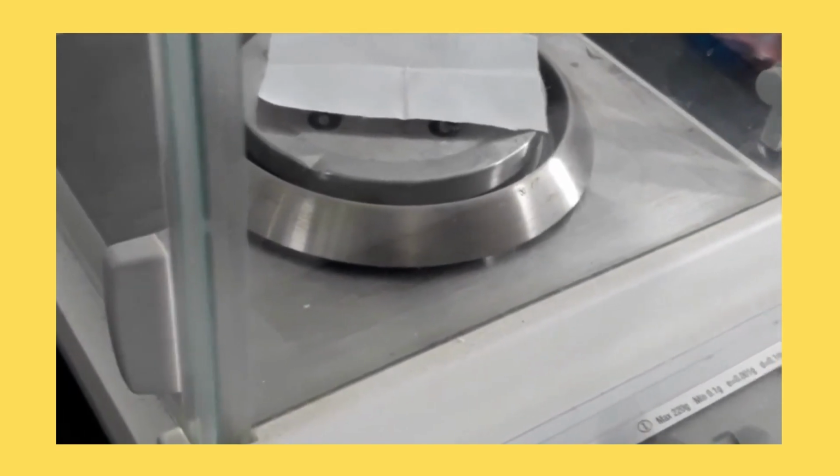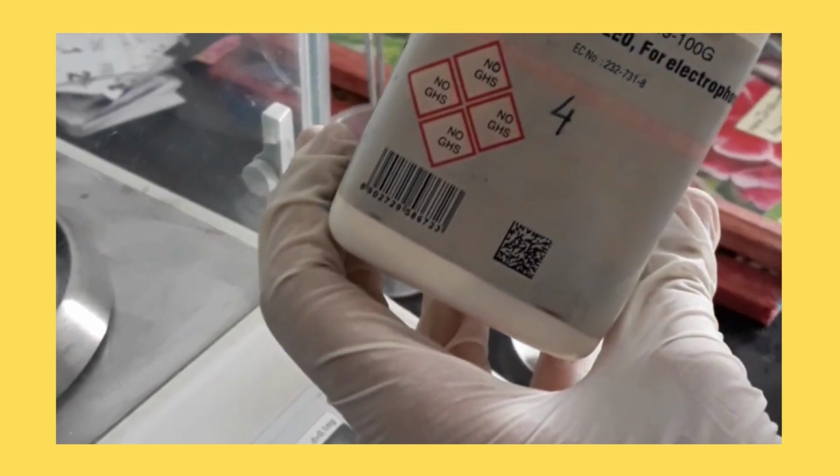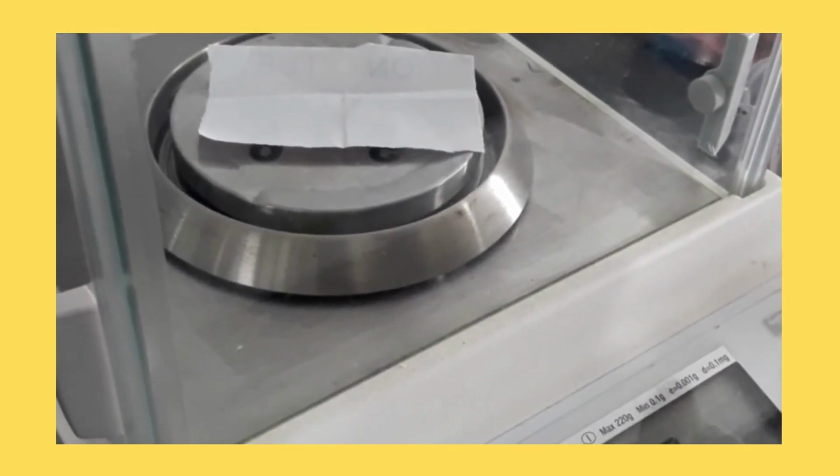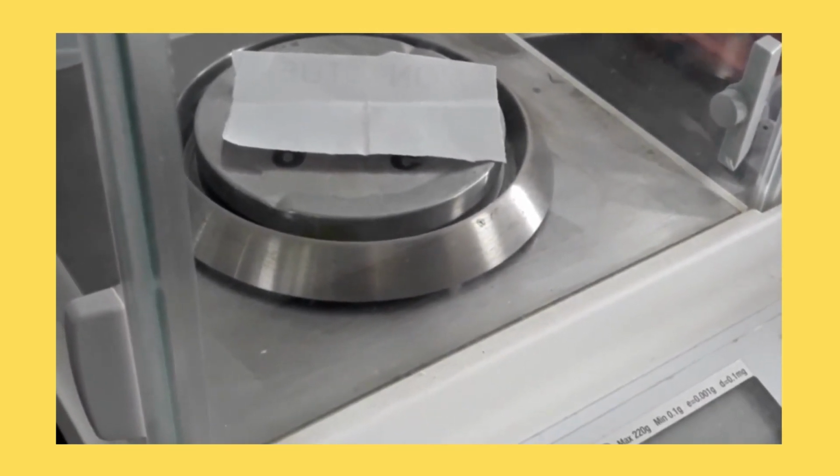To make the gel, we first weigh the agarose. We are weighing here 0.75 gram and adding it to 50 ml of TAE buffer.